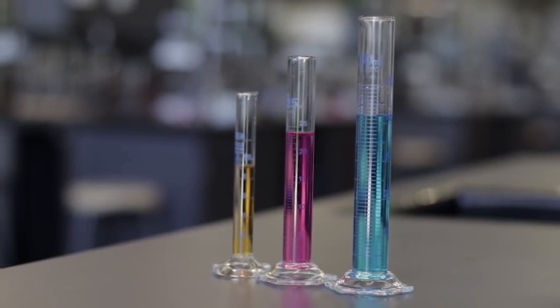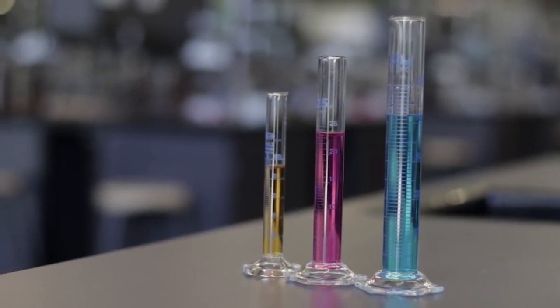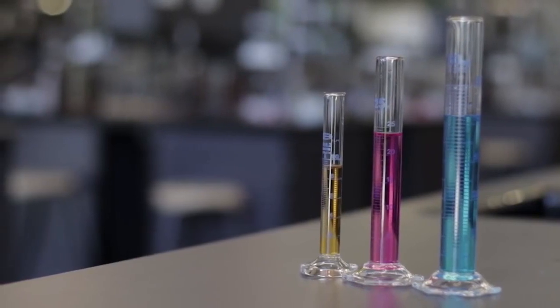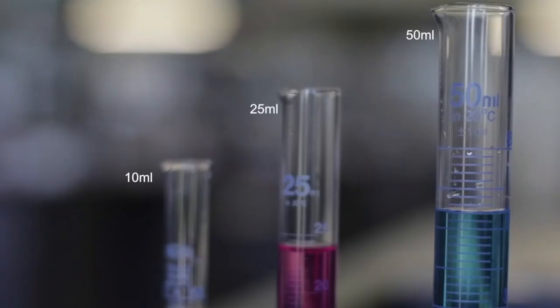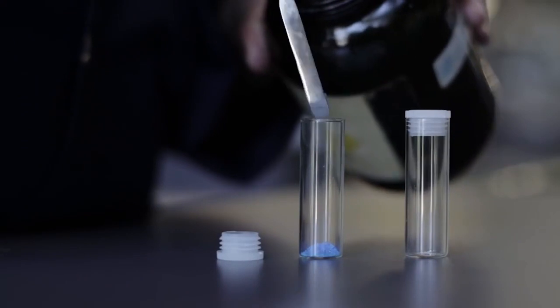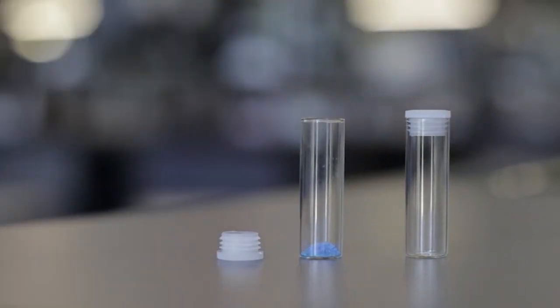A measuring cylinder is used to measure a certain volume of liquid, but is not as precise as a pipette or burette. It is found in different volumes. The volume of the measuring cylinder is found here. A weighing bottle is used for the precise weighing of solids.